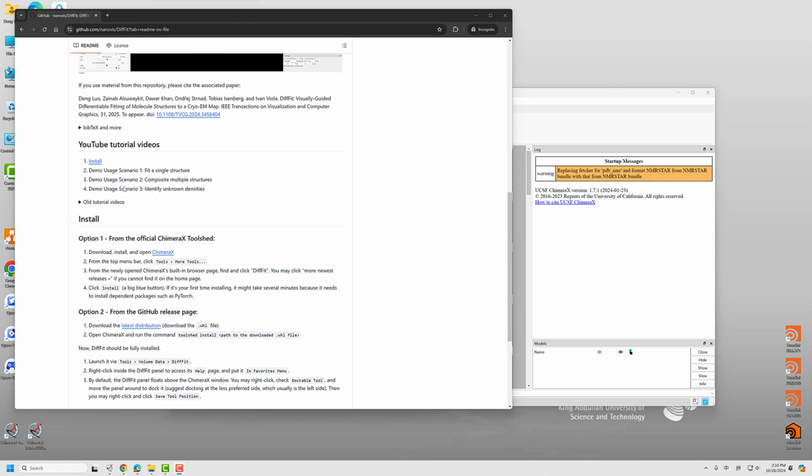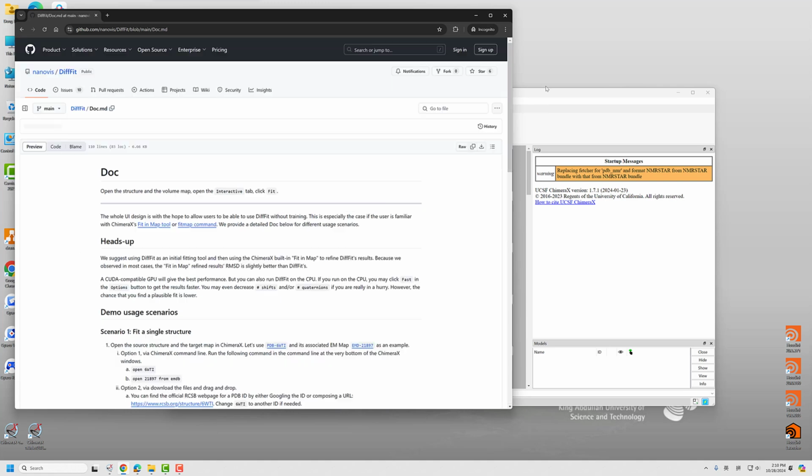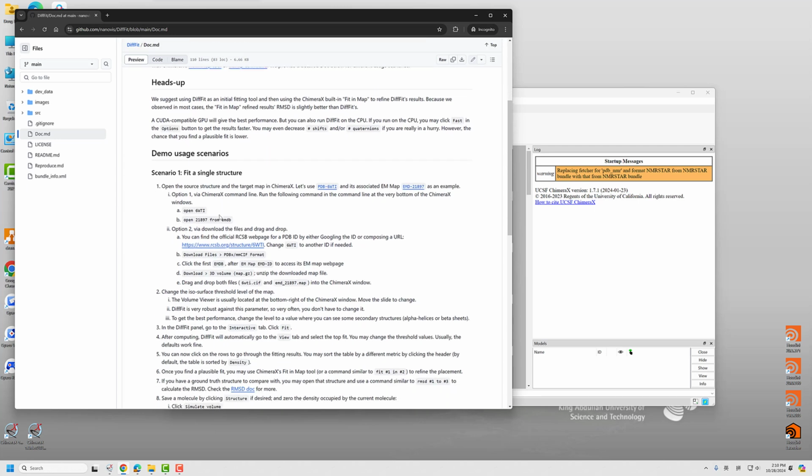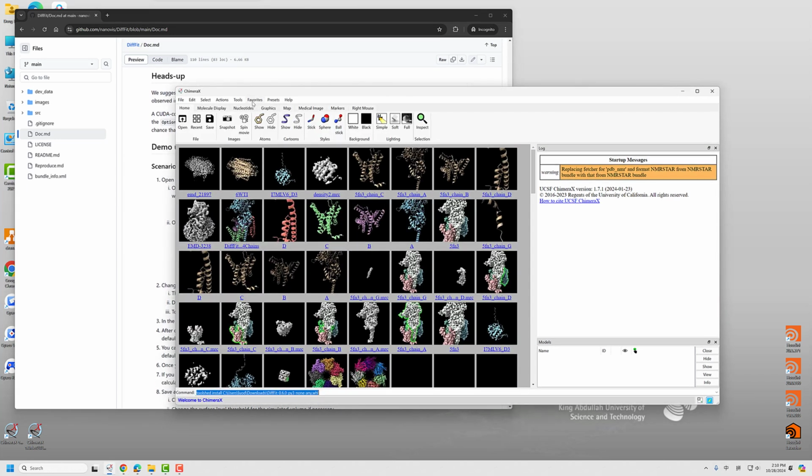Hi, this video is to show the demo usage scenario 1 of DiffFit, fit a single structure interactively. We will follow the documentation here. First, we open ChimeraX, and then we open DiffFit.